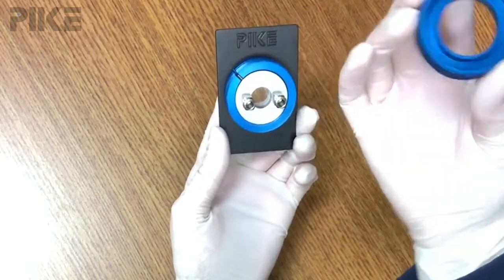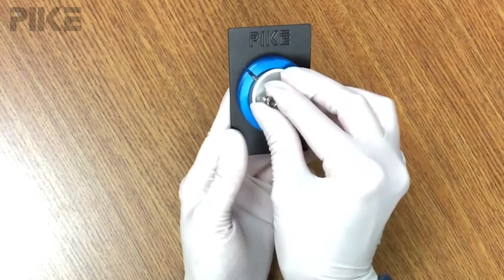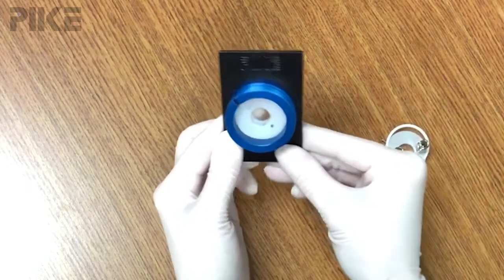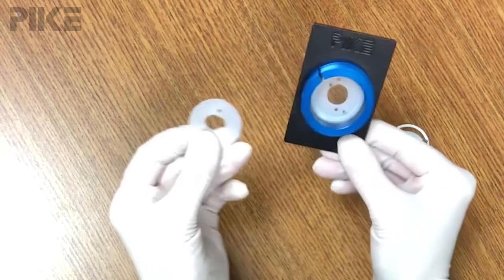Once we remove the top cap, we can access the needle plate. Now between the needle plate and your infrared window, we use a flat Teflon gasket.